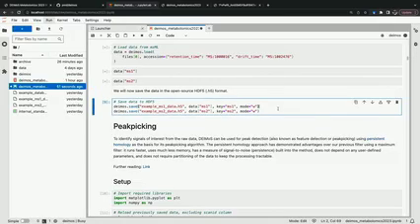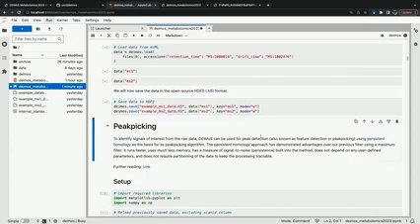And then once the data has loaded, we also wanted to demonstrate DEIMoS allows you to save data in different data formats, but we like the open source HDF5 data format typically. And so to load in DEIMoS, you use deimos.load. To save, you use deimos.save. And so we'll just save the example MS1 and MS2 data. And that might take a second to access the data file because it's quite a large one. I think it's about 3.5 gigabytes.